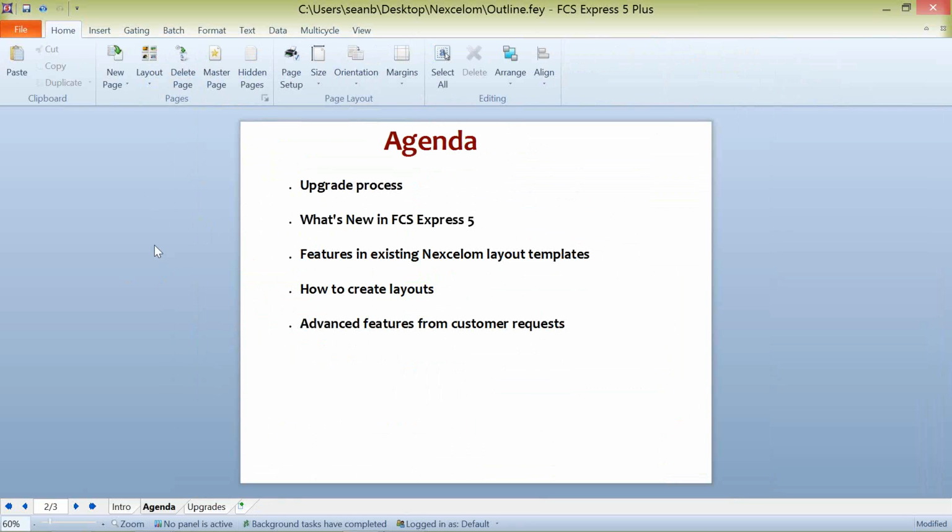Yeah, I have one question, Sean. Mm-hmm. I don't know if you've had a chance to play with FCS Express 5, but it has 3 options when you save your data: no link, link, or embed. We've had customers that move data from folder to folder and now the link is broken, and then they can't open their FCS Express file with the data. Those features all have remained the same, so there's still no link, link, and embed, and they still function the same way?